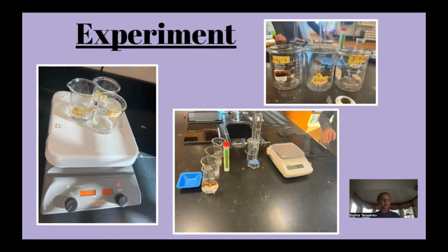The set amount of sodium bicarbonate was added to the acetic acid, both being the reactants, and this mixture was stirred and heated to successfully separate the products, CO2 and H2O, from sodium acetate. Then we found the mass of the sodium acetate for each trial by subtracting the mass of the empty beaker from the mass of the beaker with the sodium acetate.